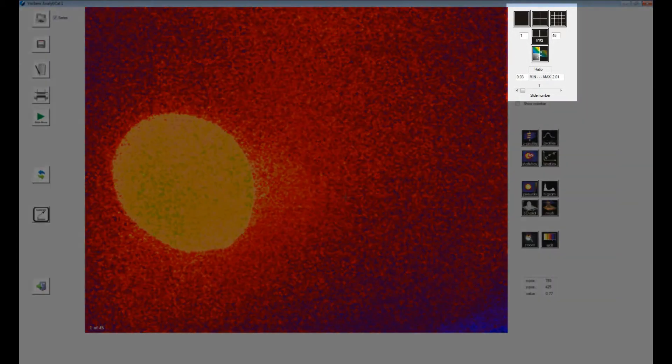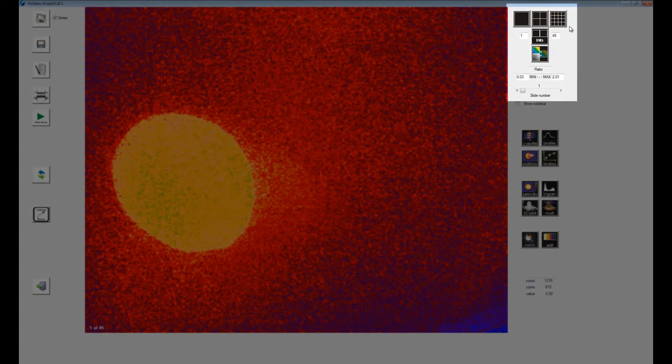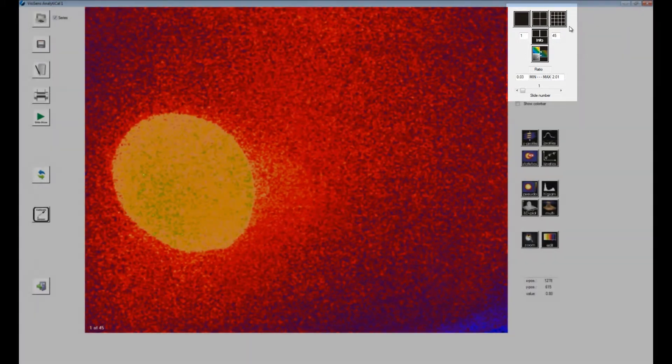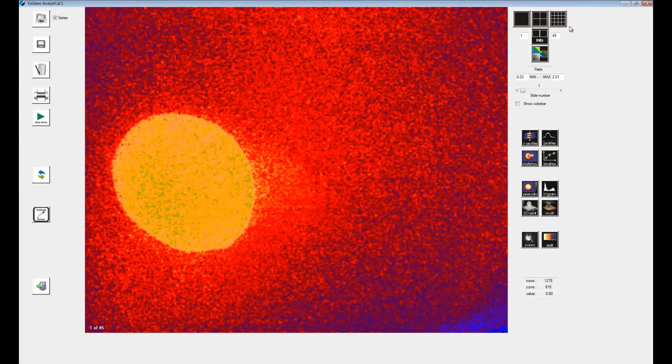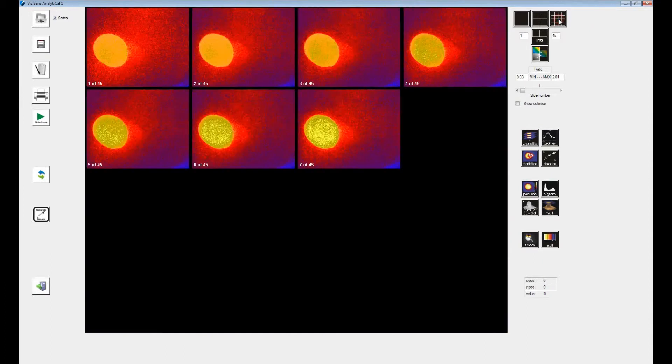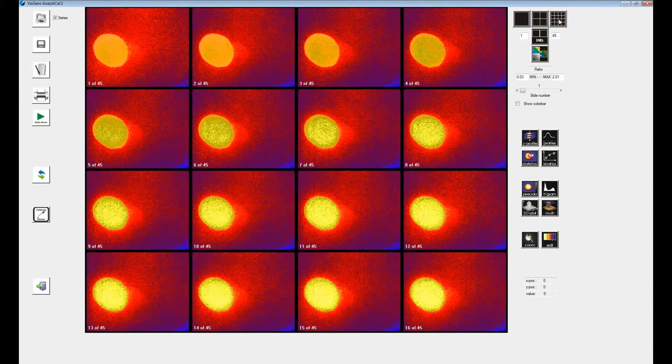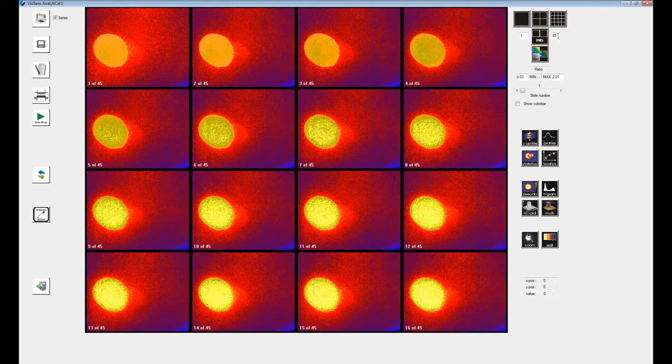In the upper right of the screen are the buttons for different display options. You can, for example, display 16 images at a time on the evaluation screen. Use the slide number bar to switch to the next 16 images.